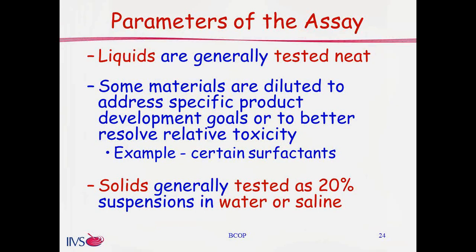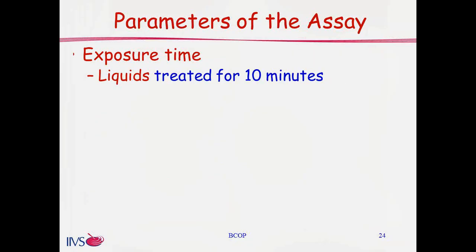For solid materials, these are generally tested as 20% suspensions, as the suspensions are typically prepared in water or saline. Now, for aqueous soluble materials, one can imagine that these typically form true solutions, whereas for hydrophobic or aqueous insoluble materials, a 20% suspension can actually be quite viscous.